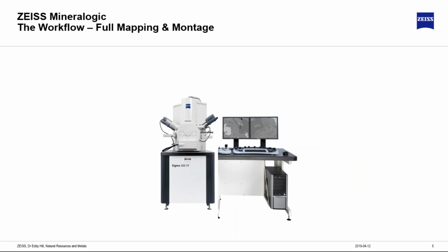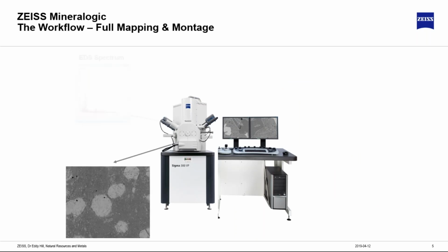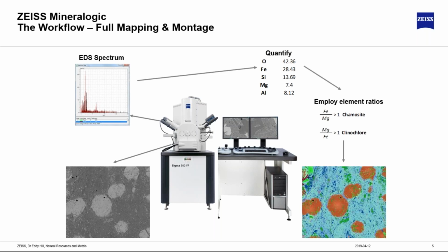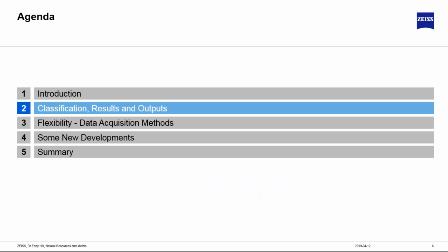As we said, Mineralogic operates on an SEM, and it's a fairly simple system where we use the high resolution image that the SEM provides. We use EDS, spectrum specifically, and quantify this to be able to classify the elements and then classify the mineralogy of the sample. All of it runs through one single PC, and immediately at the end of the analysis, we have the results available. So having said that, we use automated analysis and we quantify EDS spectra.